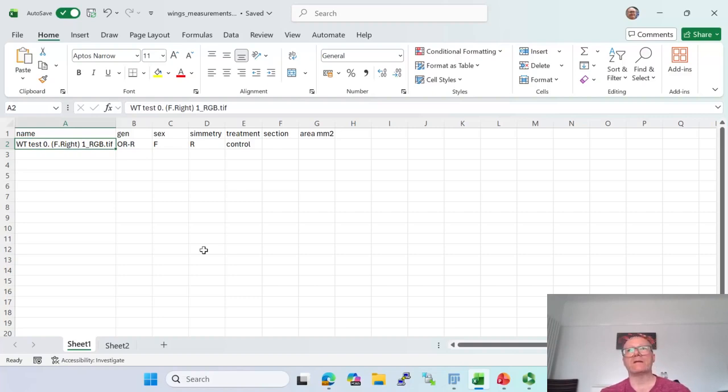Also, it is important because then you will be able to measure different pictures, and you want to have all the measurements from all the different pictures that you are assigned for your project. The name usually includes a lot of information about the picture itself.